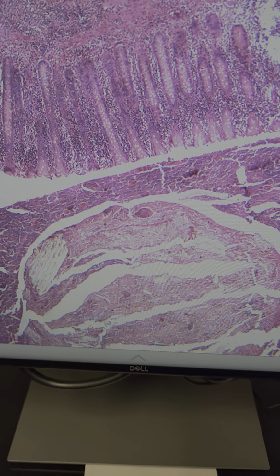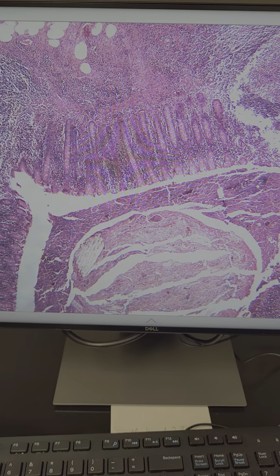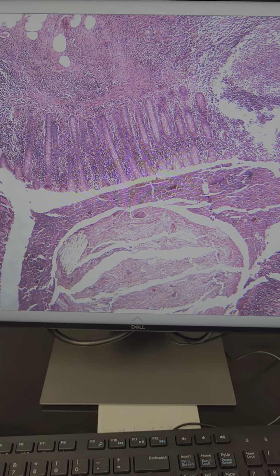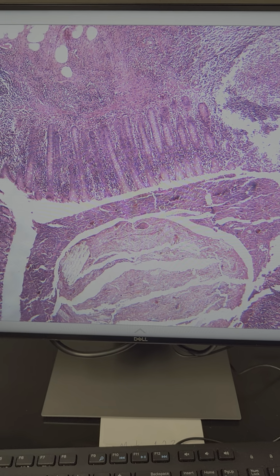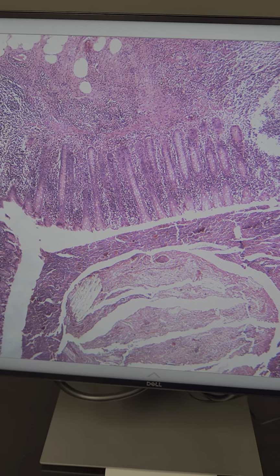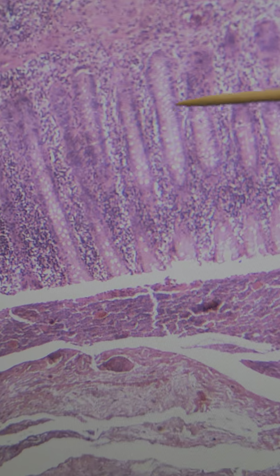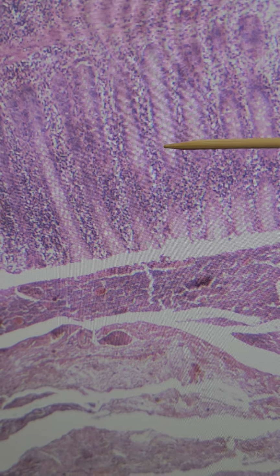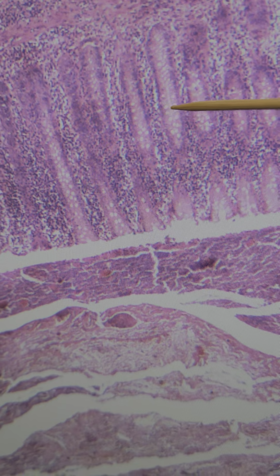This is another video on the histology of the organs for the lymphatic system, because when you take your midterm, you're going to need to be able to distinguish what type of organ you're looking at in order to determine the structures. And so the big clue that you're looking at the appendix is the fact that you can see these simple columnar epithelial cells, and there's some goblet cells in between them, which is why they look clear.